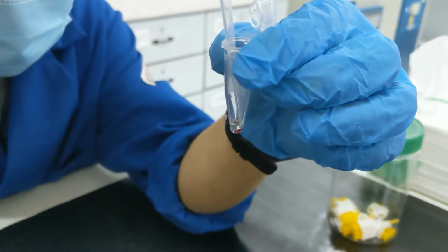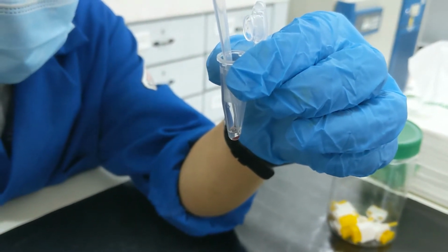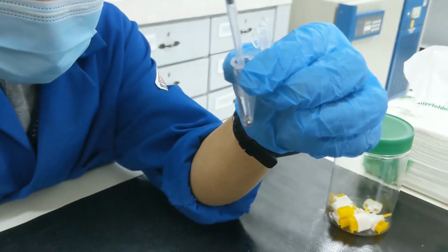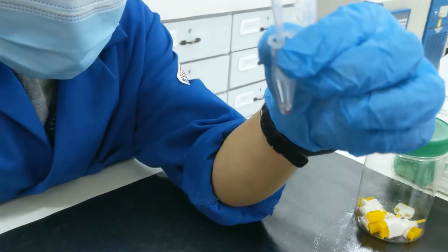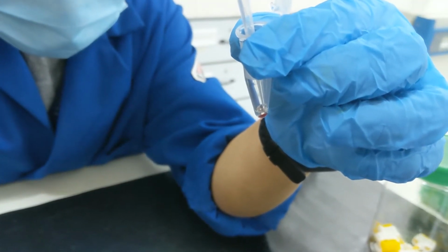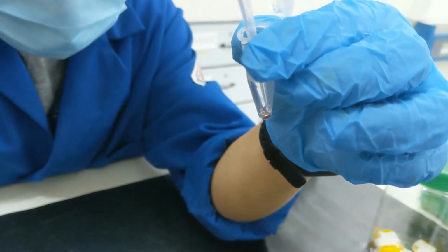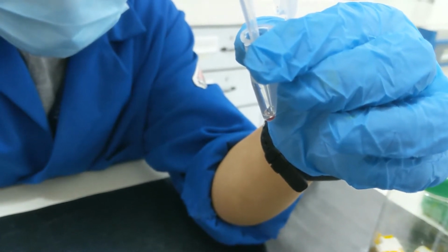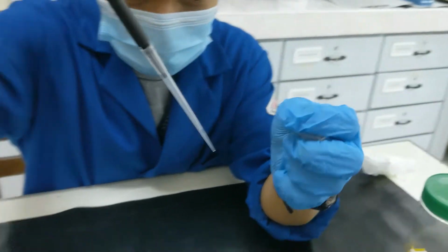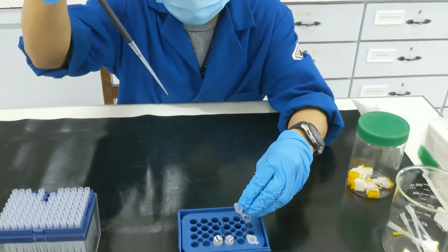So first, we need to aspirate carefully all of the serum from our centrifuge sample, making sure not to disturb the pellet at the bottom. So we will aspirate this and then we are going to transfer this into another microcentrifuge tube. So this is our serum now.